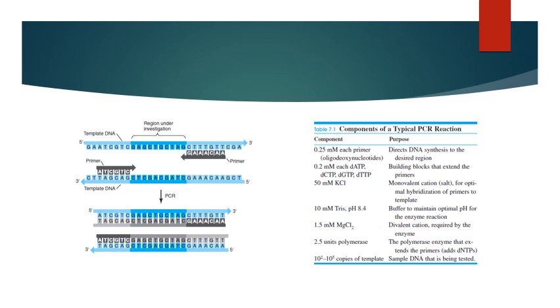Now you can increase the effectiveness of the UV light by adding some chemicals like psoralens to the amplification products after analysis. Those psoralens will actually intercalate between the bases of double-stranded DNA in the presence of long-wave UV light.